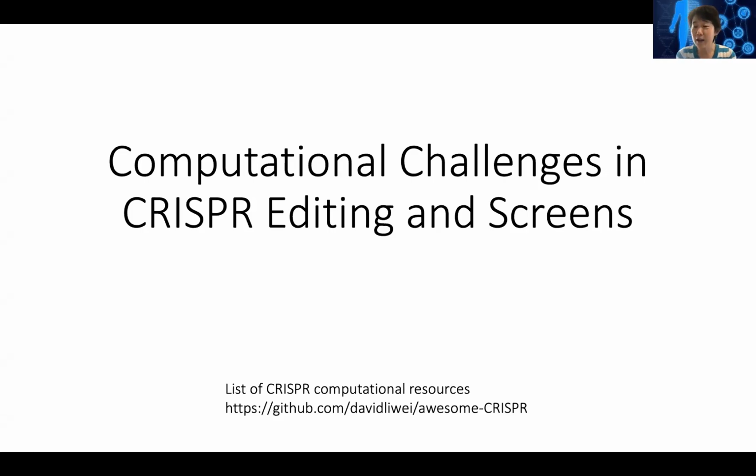With CRISPR and CRISPR screens being so powerful, there are many computational challenges involved for both CRISPR editing and screening. I want to list in here a whole list of CRISPR computational resources. You can click on this and see many computational biologists are developing resources to help CRISPR experiments. And I just kind of want to show you what people think about in terms of CRISPR.